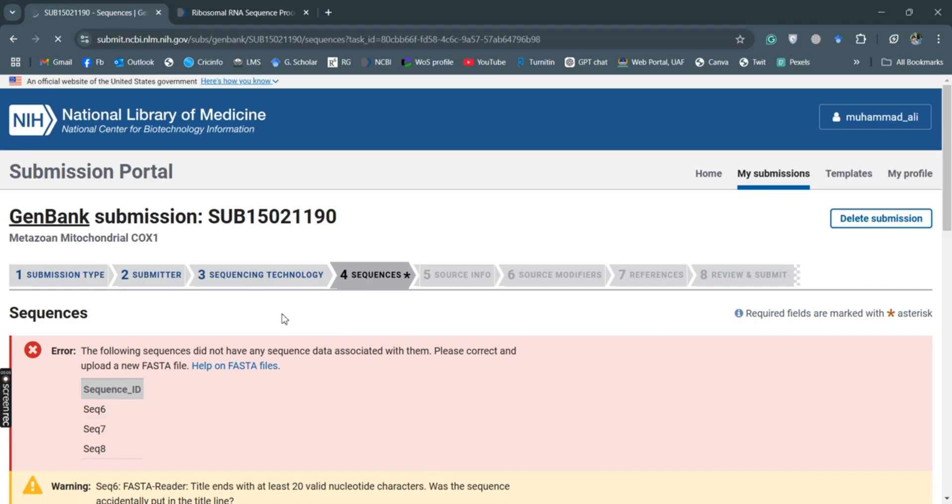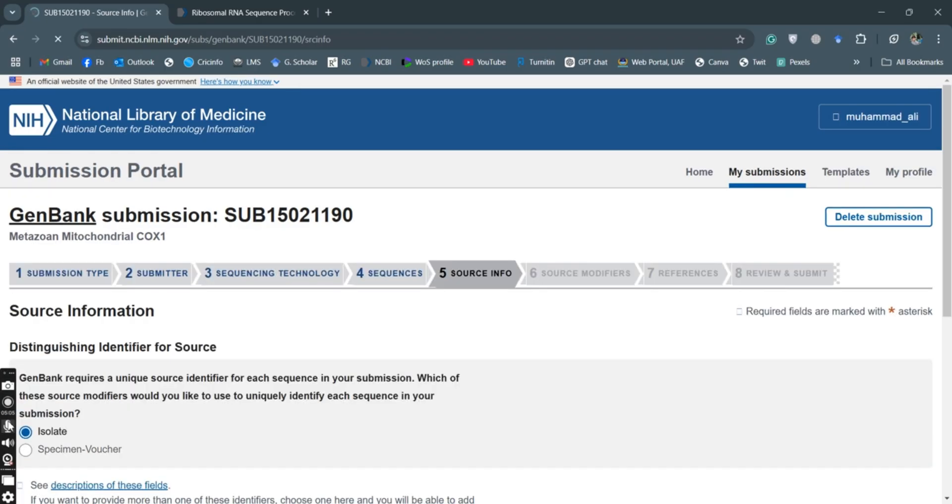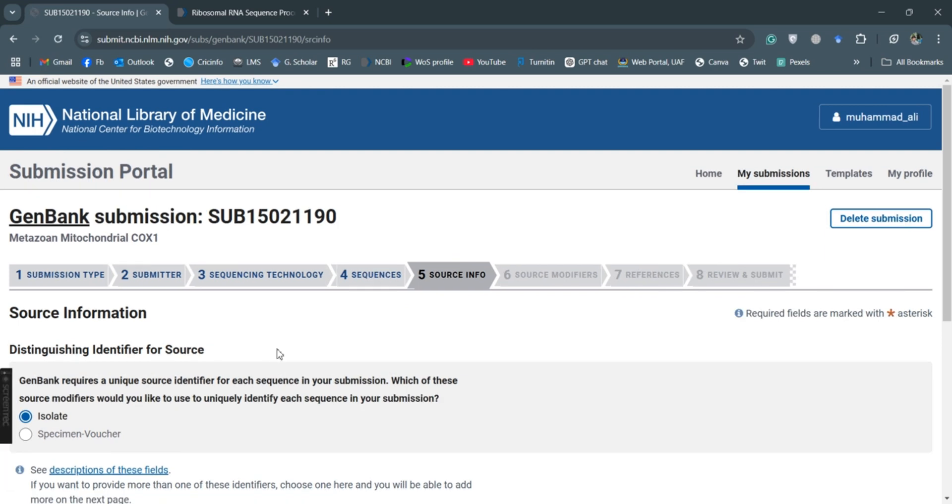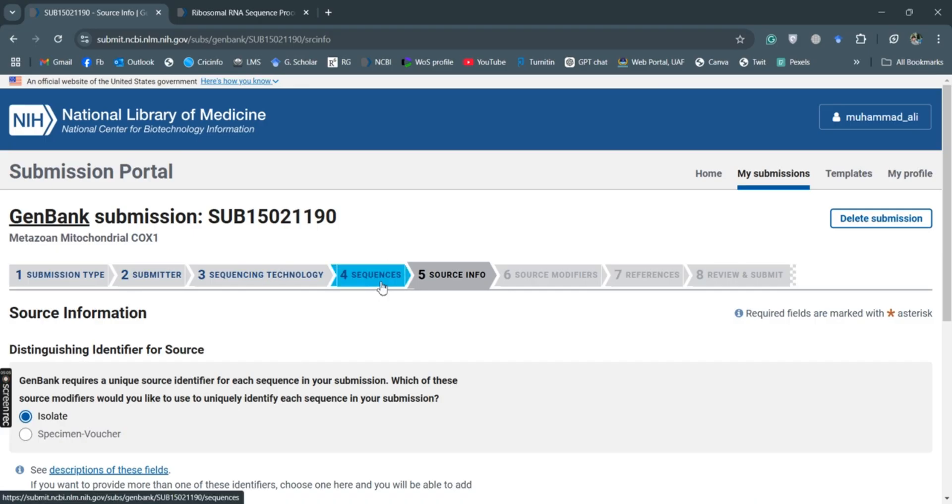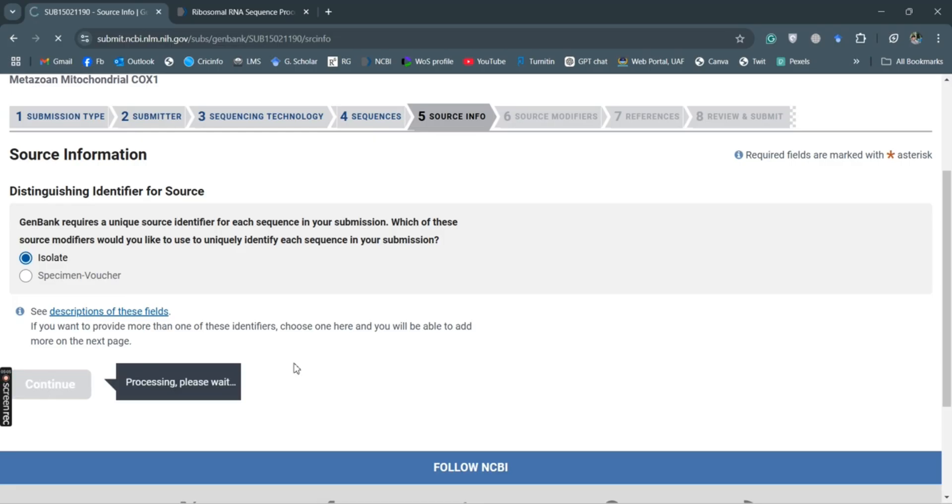This will start processing again, processing of the data. So now it is already processed and there is no problem with sequences. These are isolates, so we'll continue with the isolates.